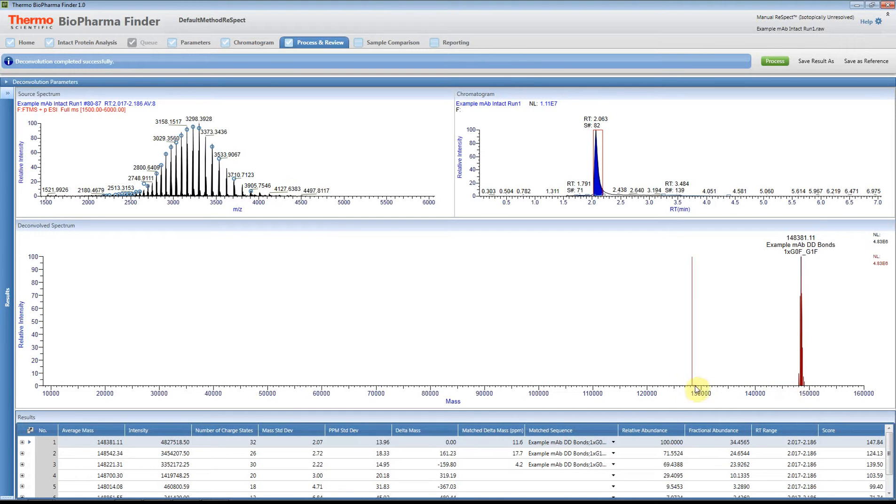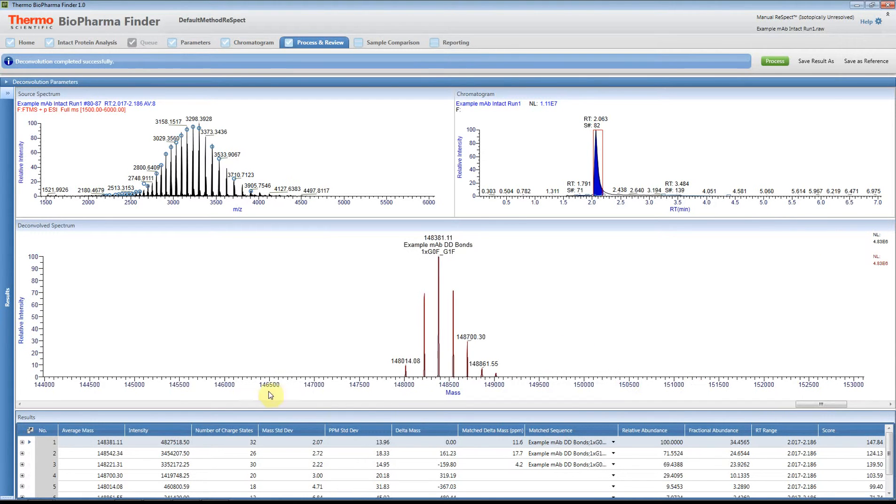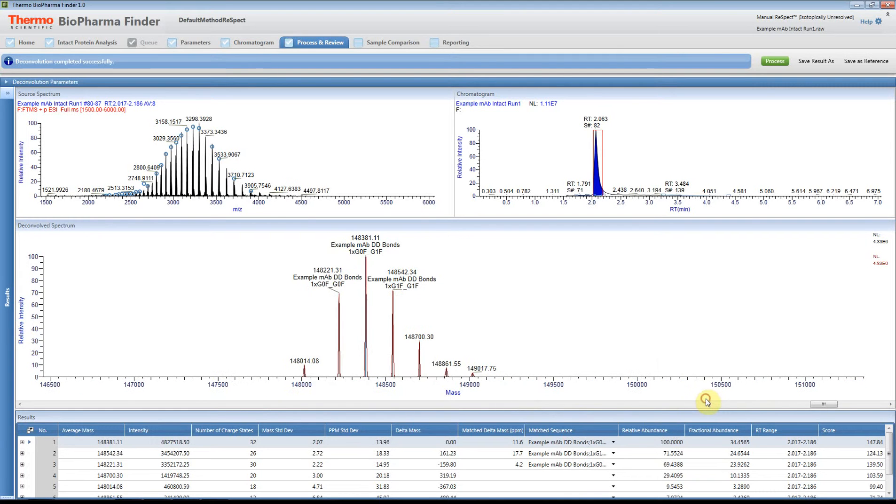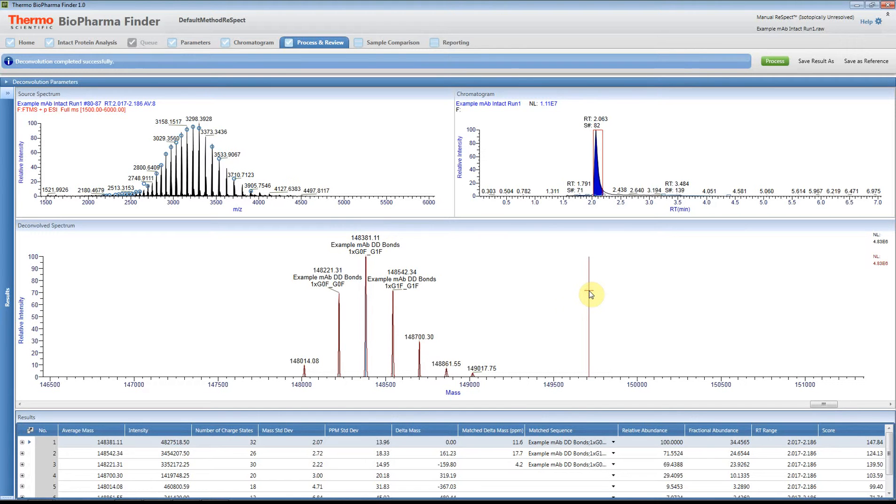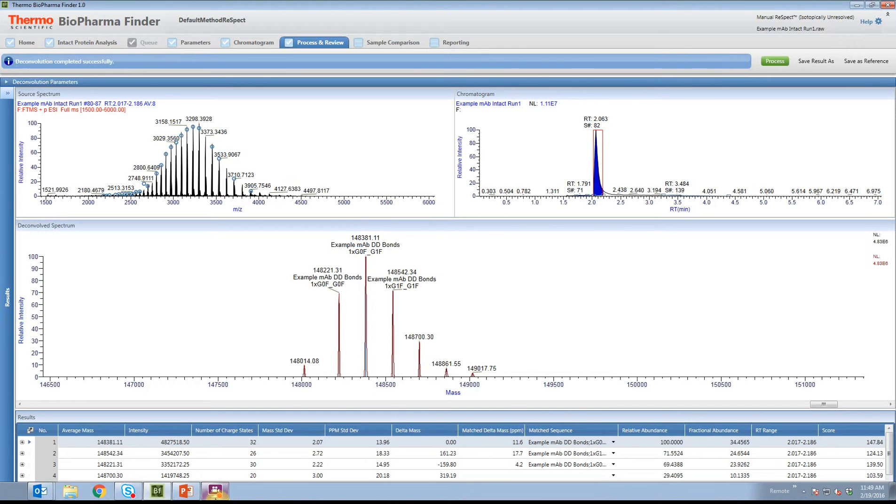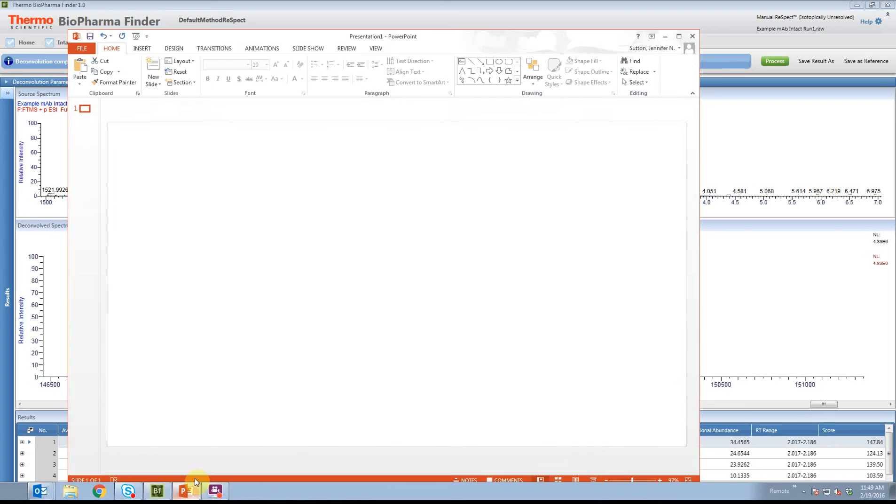This is what it actually looks like. If I zoom in, and then what I do is right-click and select Copy. That's going to copy the image, and then I go to PowerPoint.